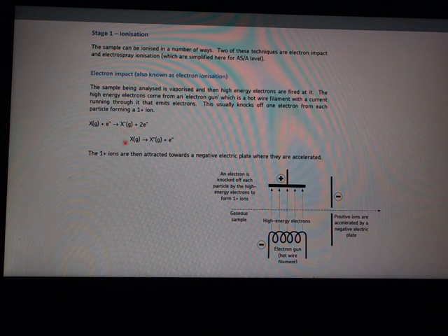Okay. Usually this is how it's written. When we want the equation for the ionization, this is what we write. Basically our gaseous sample, by losing an electron, turns into a gaseous ion, and it's that gaseous ion that can then be accelerated by an electrical plate. So one of the questions, why does it need to be an ion, is because it's the charged particles that can be accelerated by an electrical current.